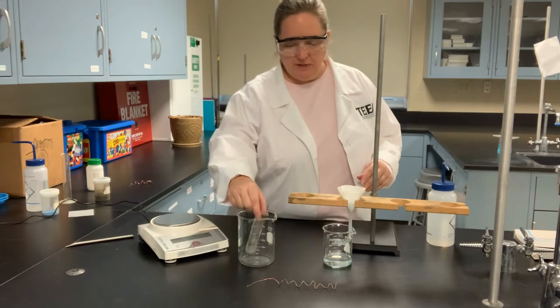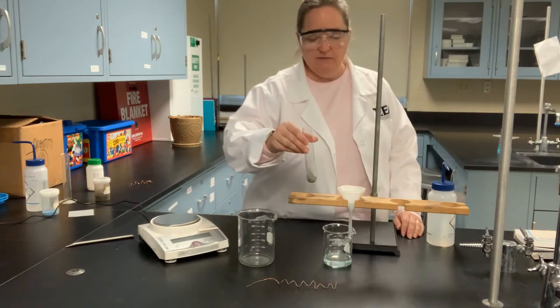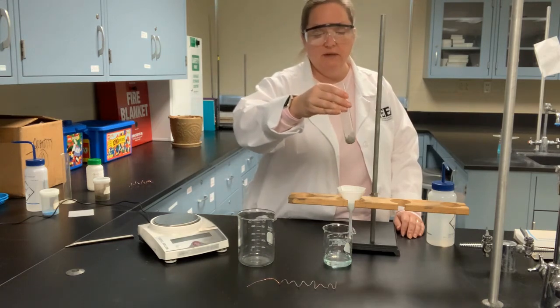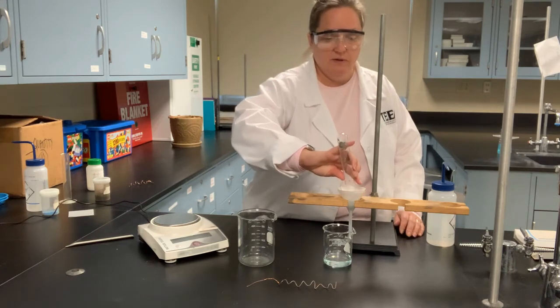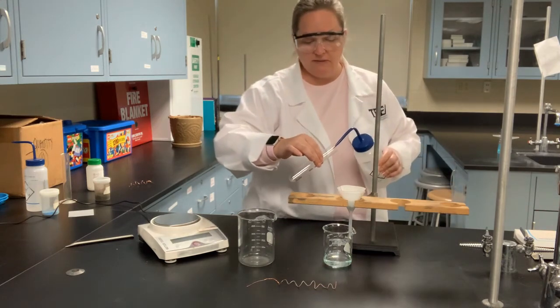Now that my solution has filtered down enough, you can see I have about 50 milliliters total of filtrate that has passed through the filter paper. Now I'm just swirling this, getting all those silver crystals loosened up so I can do what hopefully will be a quick transfer. Now that shows you what happens in real science. It really stuck to the side there.